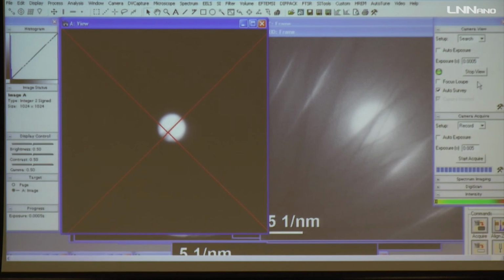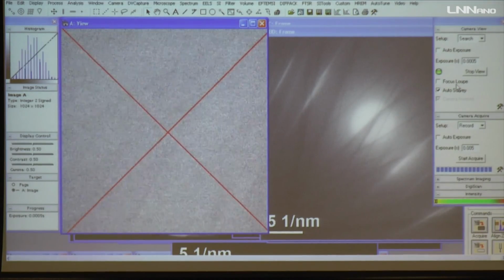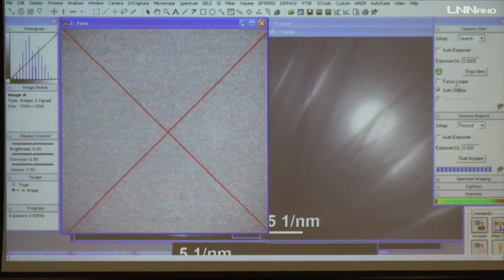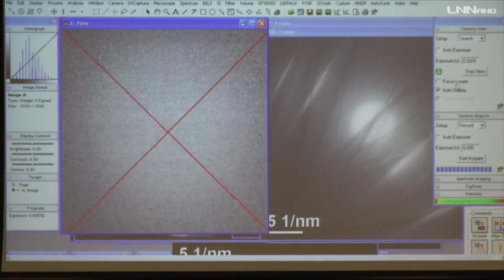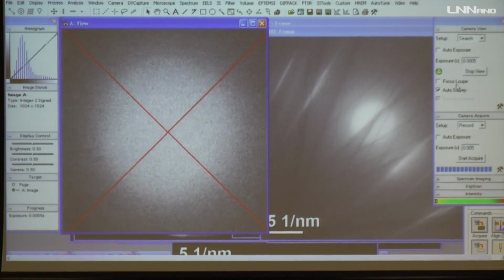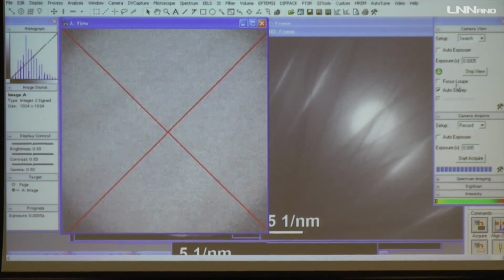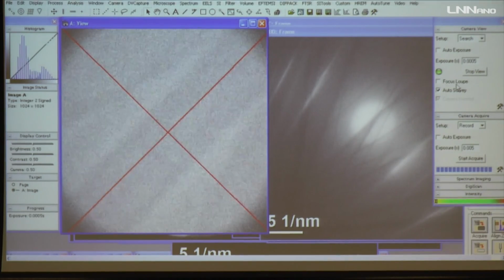If I can't, it's really simple. Just tilt the sample to a two-beam case, and you can easily observe the thickness fringes. And based on the thickness fringes, maybe in Monday's talk, I will discuss how to quantify those thickness fringes. Okay. And measuring the thickness using this CBED technique is really simple.